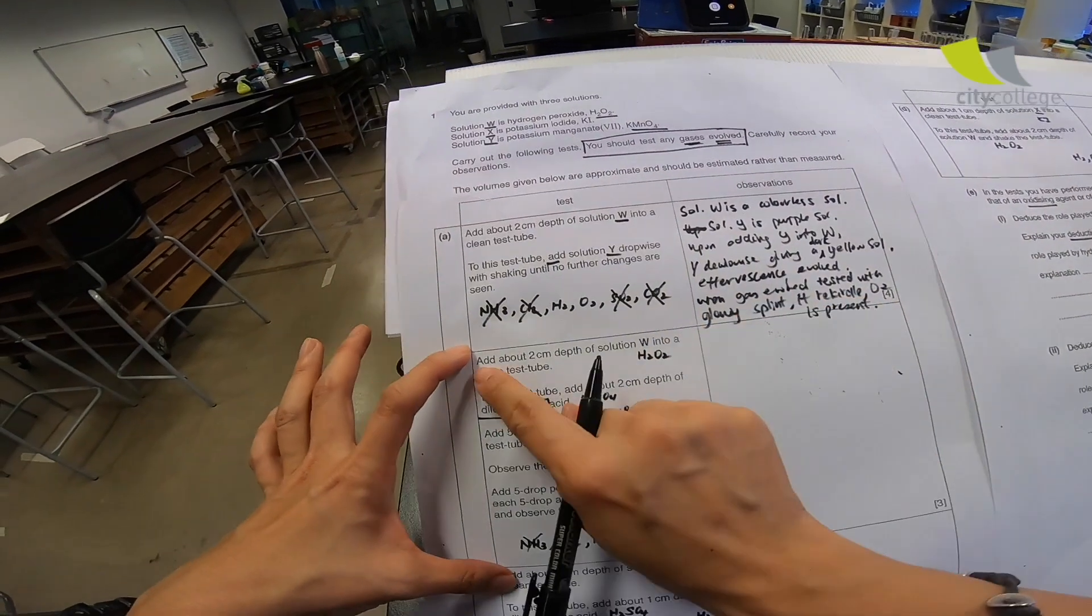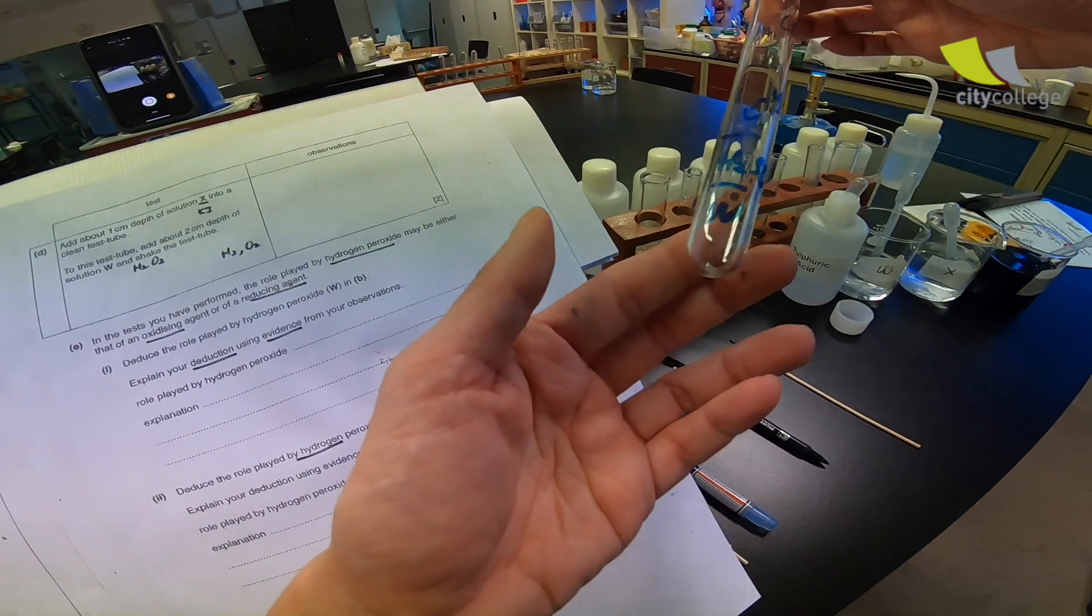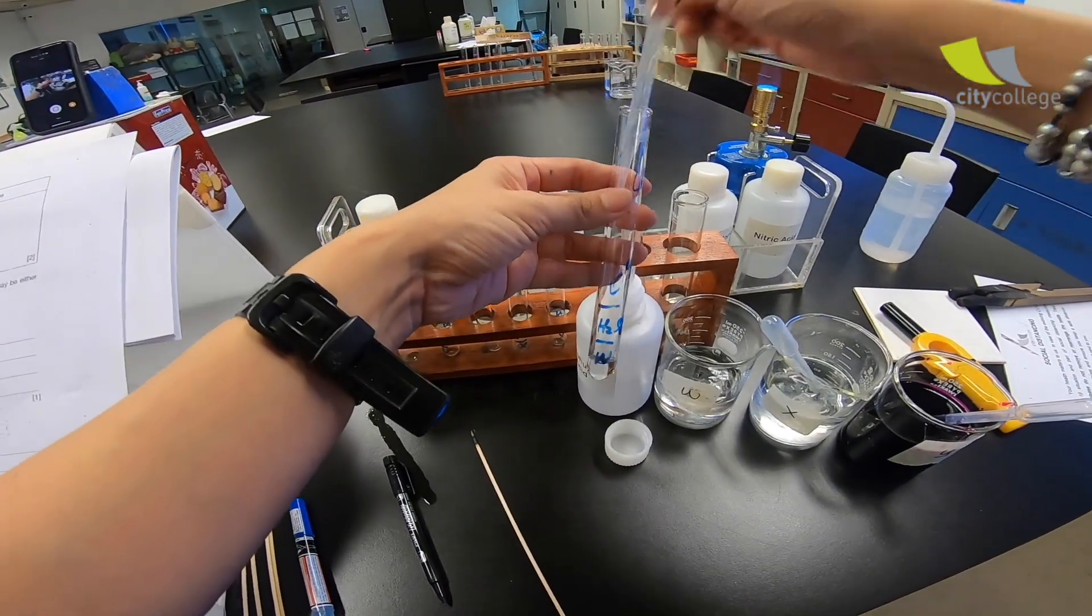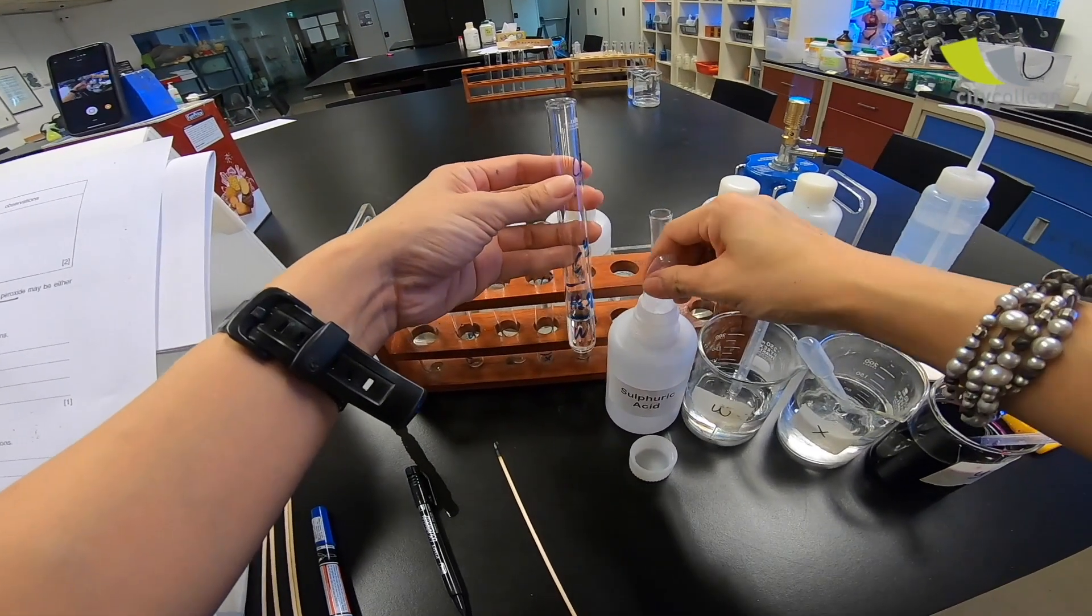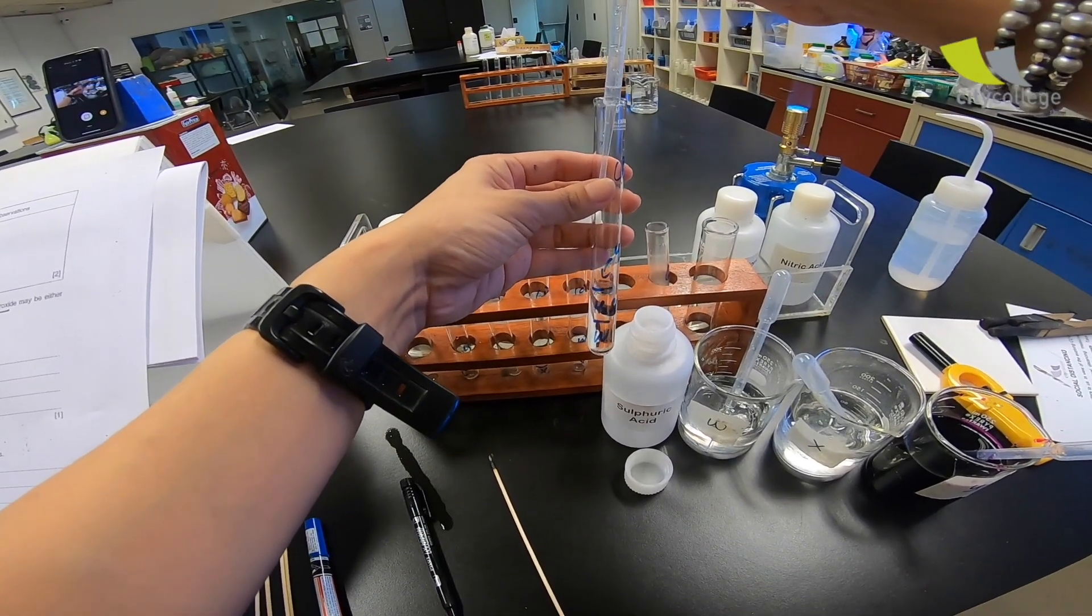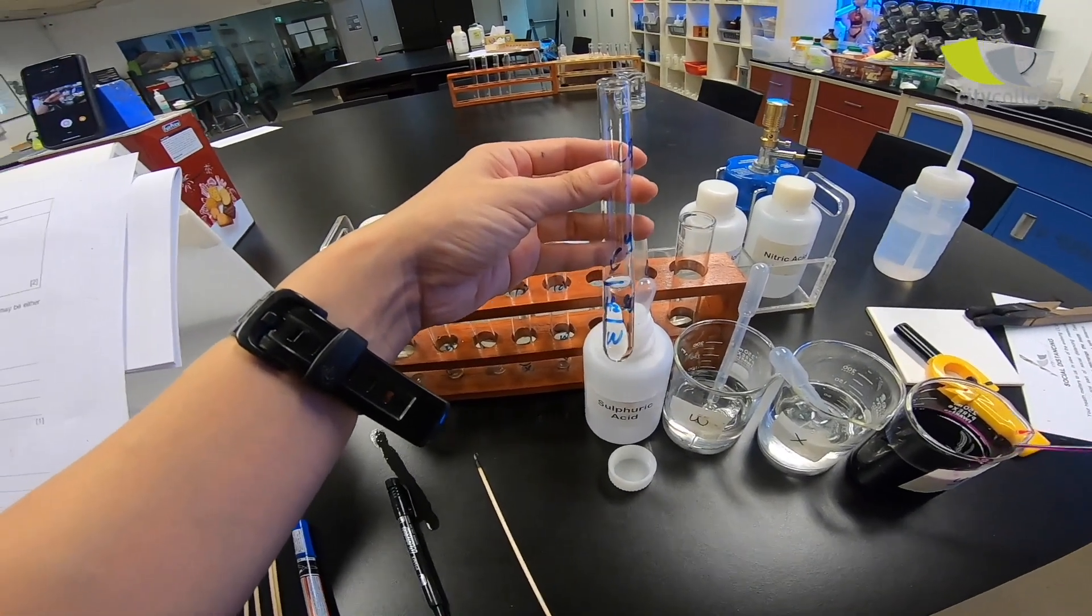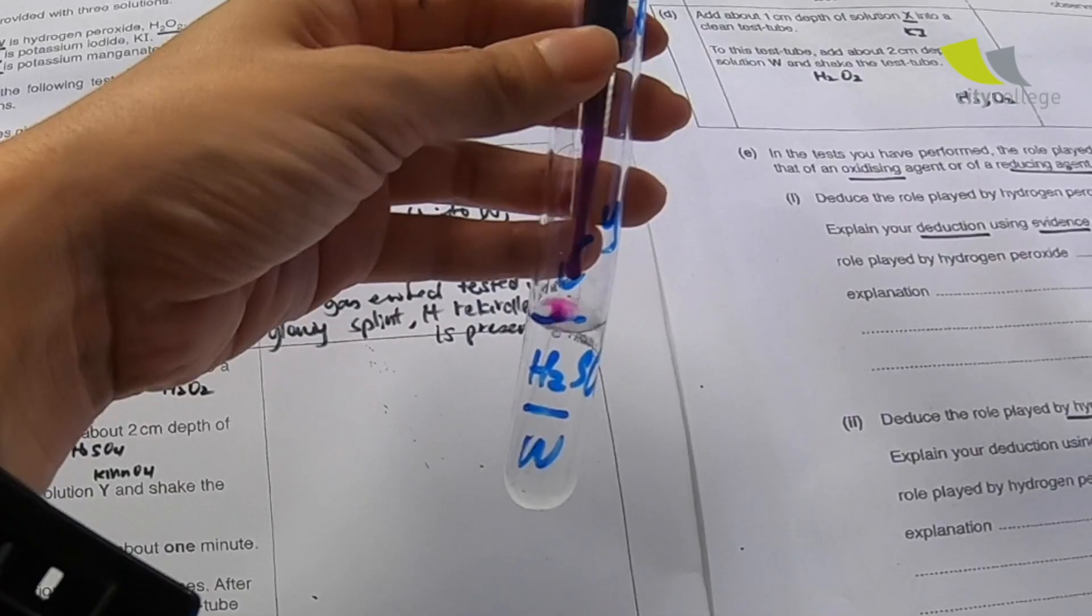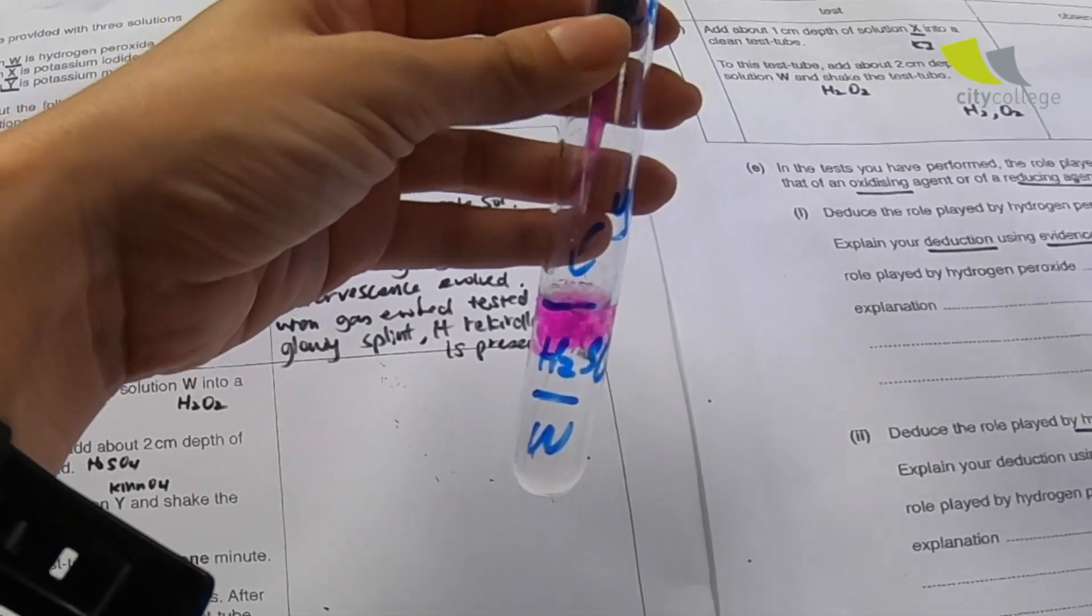Add about 2 cm depth of solution W into a clean test tube. Now, I have all the marking here, so I just need to follow the marking at W. Followed by H2SO4. Follow the marking. Then, they say add Y. In this part here, the Y is 5 drops. So, dropwise. 1, 2, 3, 4, 5. Shake.